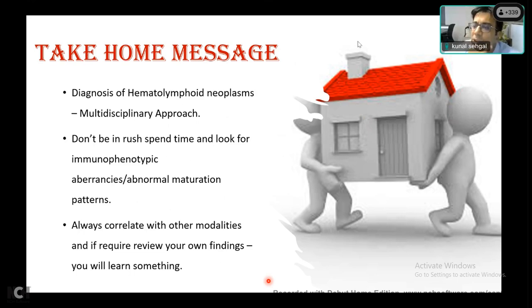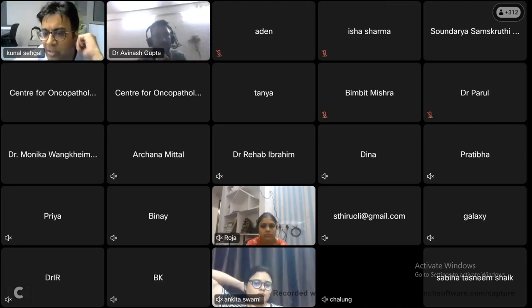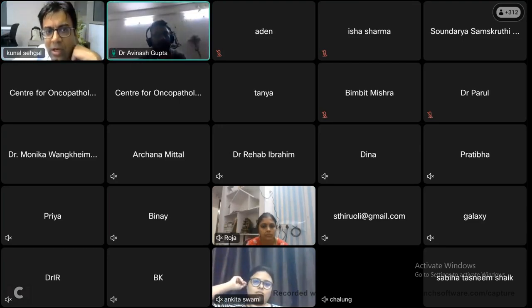So there's a question on how many minimum events are appearing depending upon an acute leukemia or MRD evaluation, and whether to call it positive or negative, that's something subjective, and you need to know knowledge of normals, which I'll discuss just now. So what I'm going to do is, I just want go ahead. Yes, sir, I just want to add one thing.